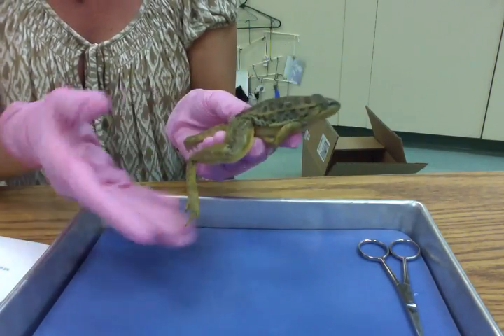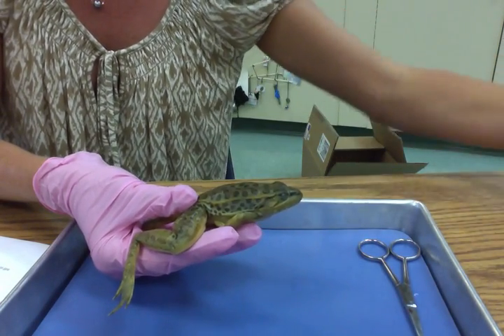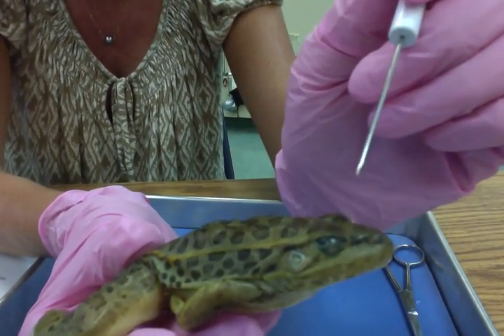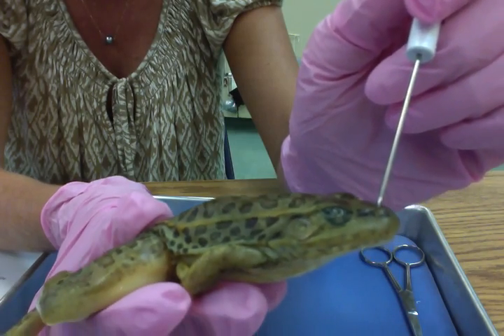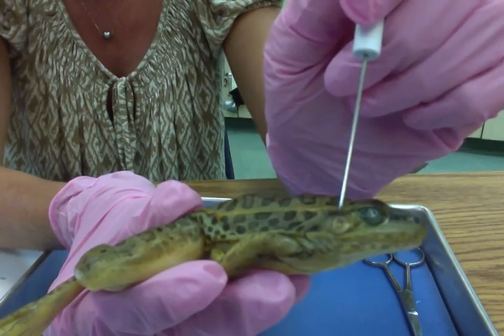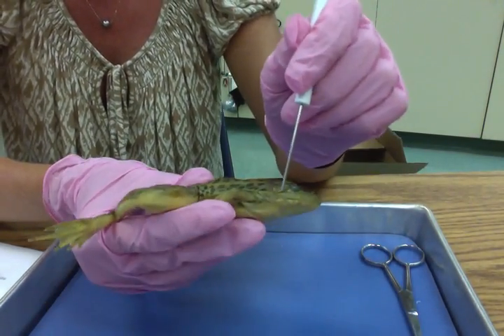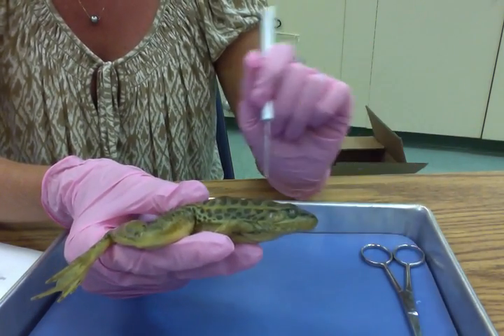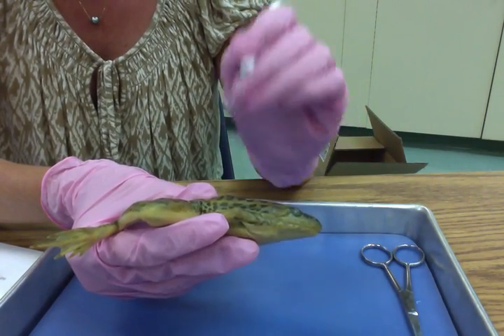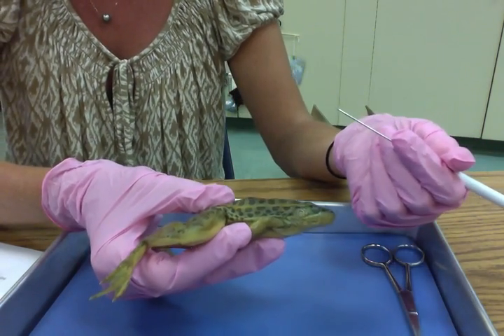Next, you're going to look to the anterior side of your frog towards the head. Identify the eyeballs. Let's get my probe here. Right, we see the eyes. So we see the eyes, the nostrils are right up here. And then you kind of see this circular indent of skin. If you recall, when we did our grasshopper dissection, we also saw a circular indent around that same area. And that was the grasshopper's ear, also known as the tympanum. This circular indentation is the frog's ear, or the tympanum. So tympanum is just the scientific way to describe the ear.